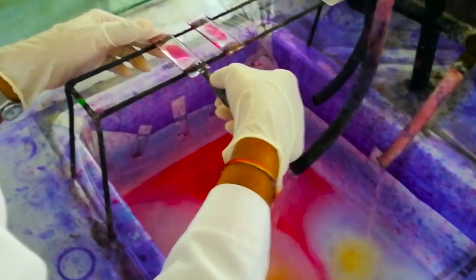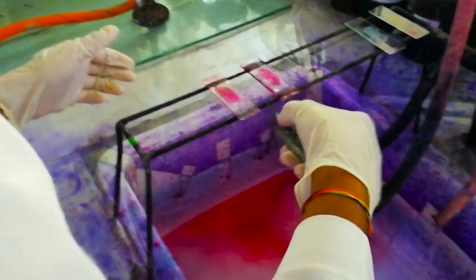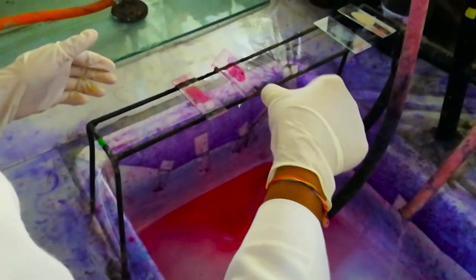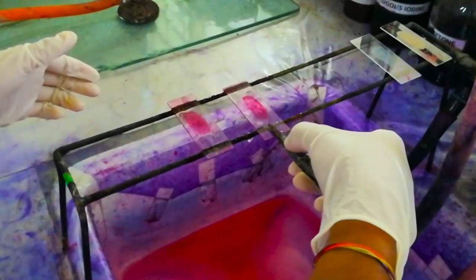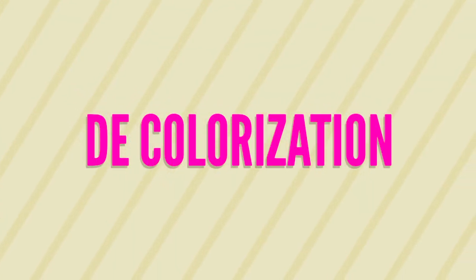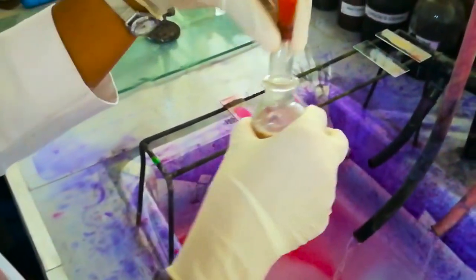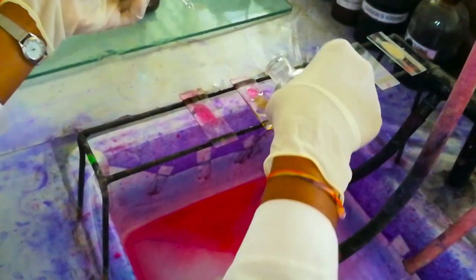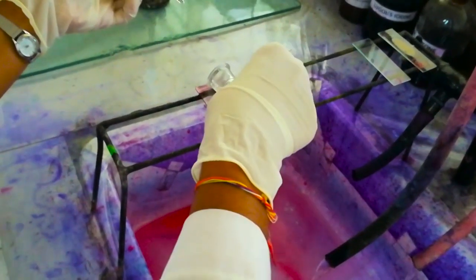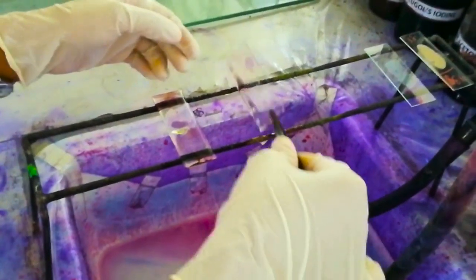Tilt to drain excess water. Next, pour 20% sulfuric acid and keep 2-3 minutes until stain becomes pale pink color. You can repeat this process if necessary. Then tip off excess and wash with water.